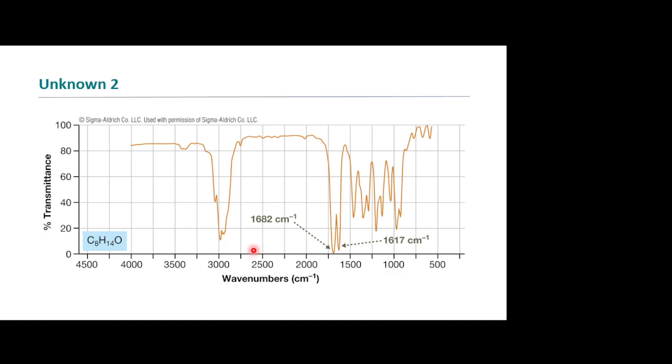Okay, so one of the possible methods we could do here is we also only see how many bands right there? No, this higher frequency one. Yeah, so you'll see here we have a whole series of bands, right? See that? Ding, ding, ding. This right here, though, we only have the one band, don't we? So what does that tell you about that hydrogen? Is there several different hydrogens?